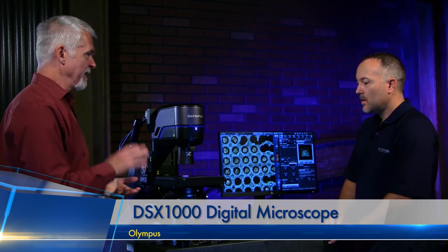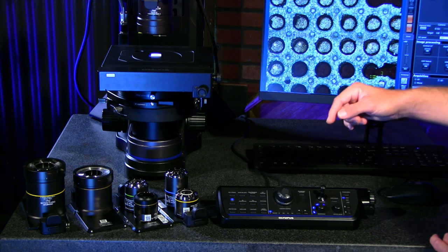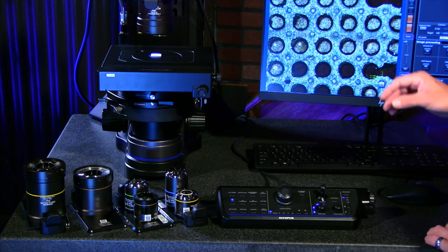You don't need to have direct access to the microscope and you're not having to click and slide and drag things using a mouse either. It's an easier interface. Customers wanted to move away from the mouse clicks and movements. It's great for ergonomics. The ability to stand at the tool and change your adjustments on a hand switch, to break up the monotony of using the mouse continuously. Single button pushes to capture an image, move the stage, change observation methods — bright field to dark field — all at your fingertips. Everything's motorized and controlled by the hand switch and the software interface.